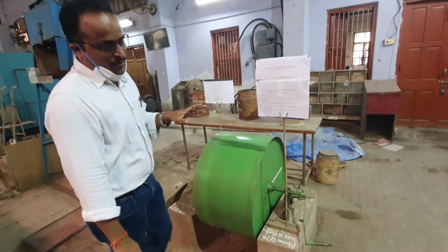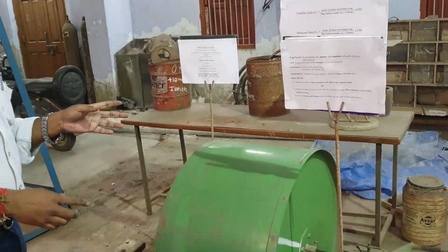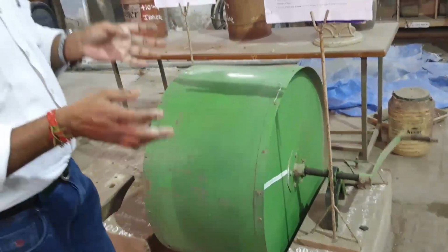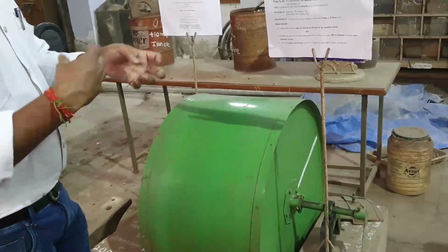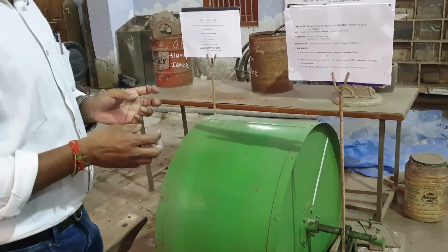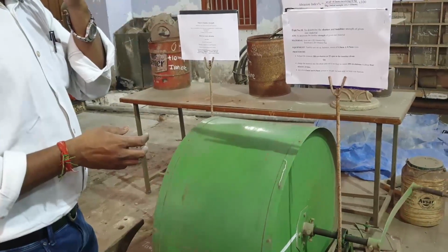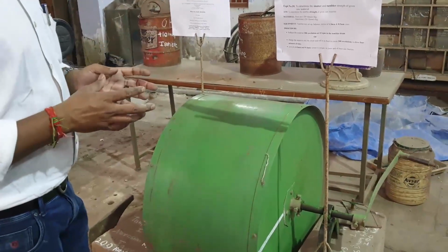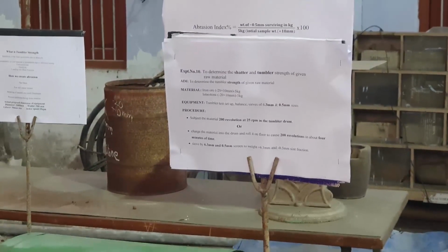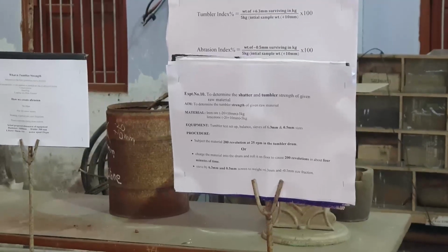Why are we doing this? Because when we are loading, unloading, and transporting, the material will be subjected to this impact. Because of that, material disintegration will happen. It may break into pieces. So that's why we need to check whether this material has sufficient strength or not. It should not be broken into small pieces. Otherwise, you can't use the material.